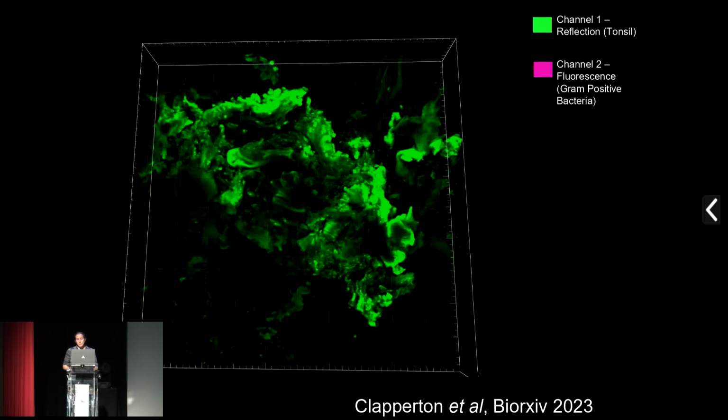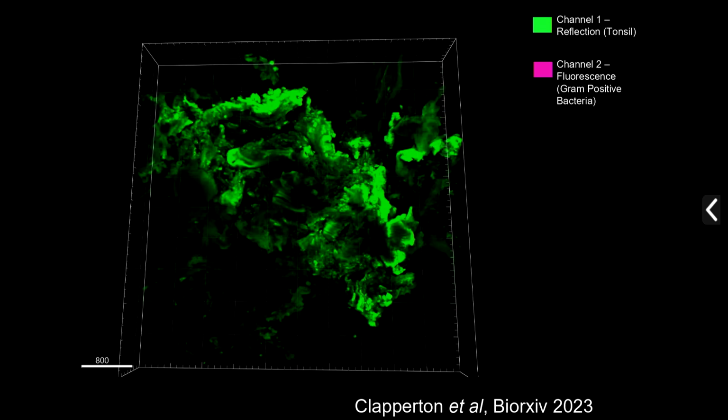We're also using the Mesolens for studying clinical samples. So roughly twice a week, one of my students will go to the local hospital and collect human palatine tonsils. And what we want to do is really understand whether the rate of tonsillectomies that's been performed, certainly in the UK, is warranted. It's one of the most contentious surgeries because it takes place in children, and that's never great. But it has one of the highest post-operative bleed rates. Roughly 1 in 5 patients is going to be readmitted within 2 weeks, and it costs them a lot of money. It doesn't help with their social and educational development. So in the UK at least, it's certainly highly contested.